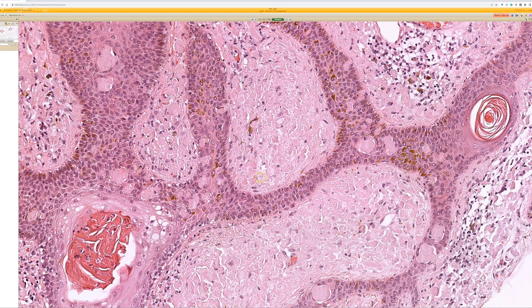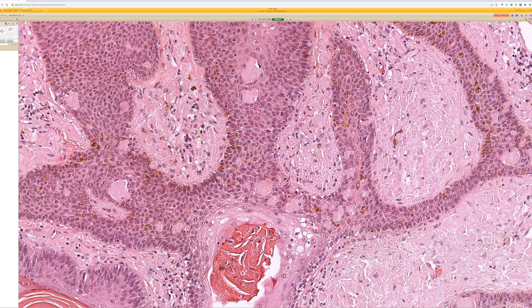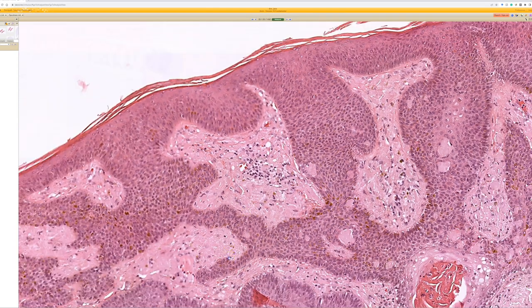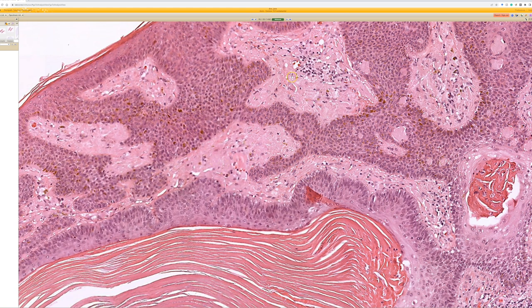Anytime I see this, it's a pretty thing — I point it out to the resident sitting with me, and then I sign this case out as inflamed seborrheic keratosis. I do not mention the amyloid in the comment or anywhere, because it doesn't matter clinically. In my opinion there's no way this could be systemic amyloid or light chain amyloid — you can see the cytoid bodies, you can see the pigment, it's only in the papillary dermis. I've never seen a case of systemic amyloid present in this manner. The only reason you'd mention it is in the microscopic description for teaching purposes — in that case just get yourself a teaching recut. I don't put it in the report because I don't want someone to read it and freak out when it's a totally benign, incidental finding.